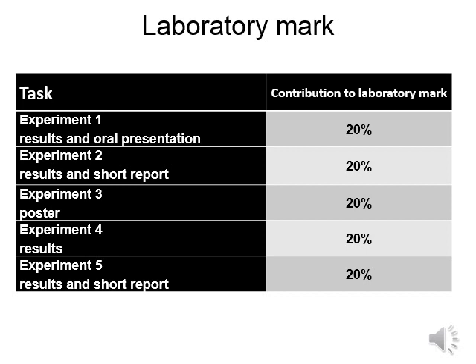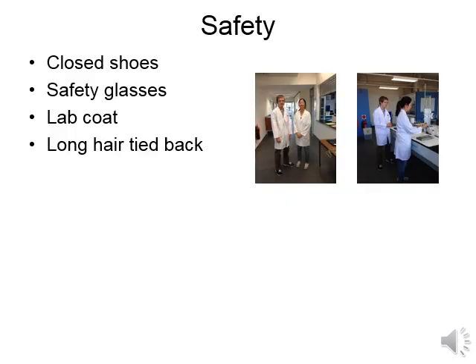During the first week of lab, your demonstrator will also provide some training about presentation of results in reports. It is essential that you think about and work safely whenever you are in the lab. You must be wearing closed shoes, safety glasses, a lab coat and have long hair tied back at all times. Whenever you step out of the lab, even if it's just to go to the toilet, you must take off your lab coat. You are not allowed to wear a lab coat anywhere in the common areas of the building.